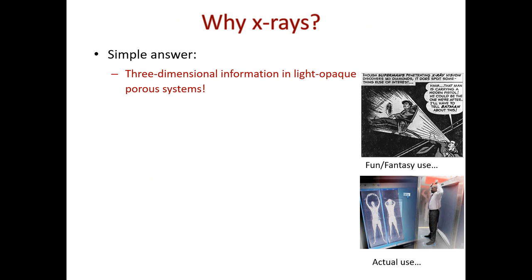However, if I want three-dimensional information, I have to, as we mentioned last time in the X-ray lab, take multiple projections. So this is one projection. I either have to rotate my sample or rotate my set of source and detector around the sample to get those projections. And then from projections, we're going to go into a little bit more detail after these introductory slides. From those projections, I can reconstruct a three-dimensional image without destroying the sample, which for imaging people is very important.